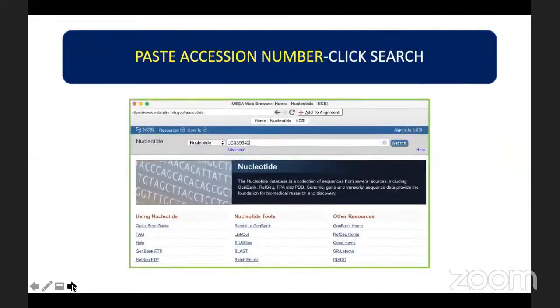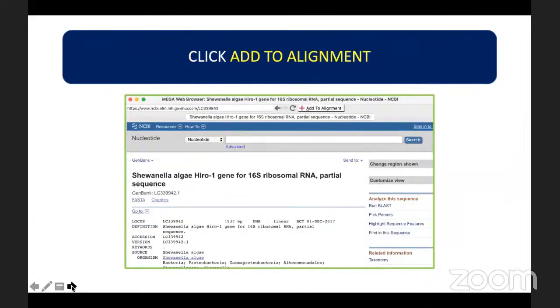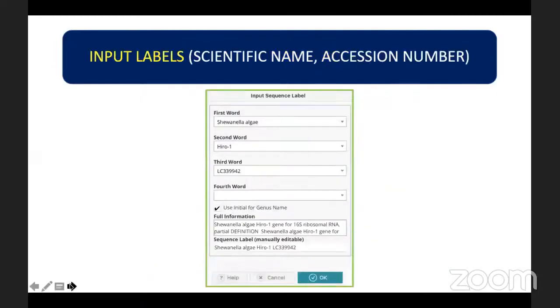This will bring you to the nucleotide database in the NCBI website. Paste the accession number and click Search. You will get to the GenBank database where the sequence in FASTA format is recorded. Click the Add to Alignment button at the uppermost part of the screen. There is a prompt where you can add labels to your DNA sequence sample — choose the suggested label, for example Shewanella algae, the strain, and include the accession number. After setting the sequence label, click OK.